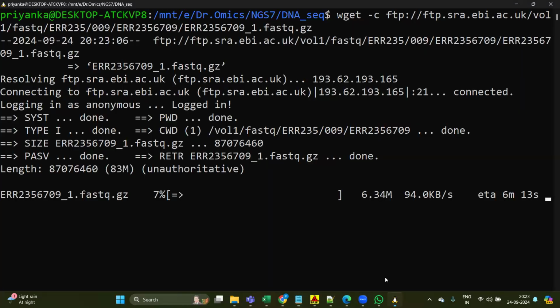So download these files. It will take a bit of time. Let me know whenever your raw data has been downloaded also.